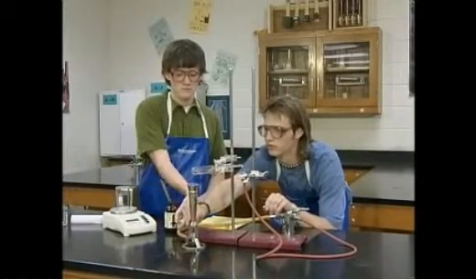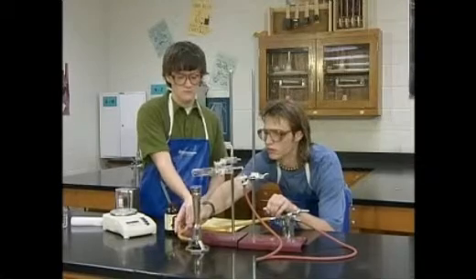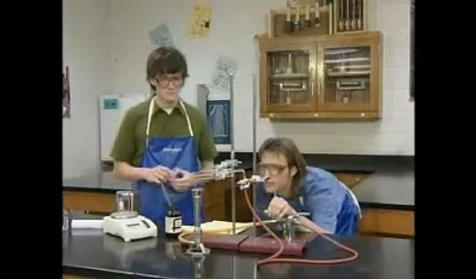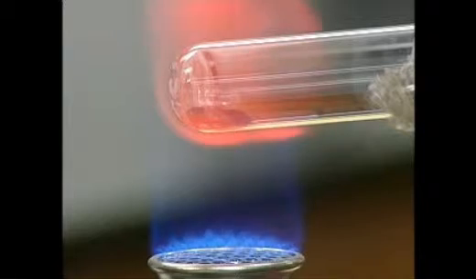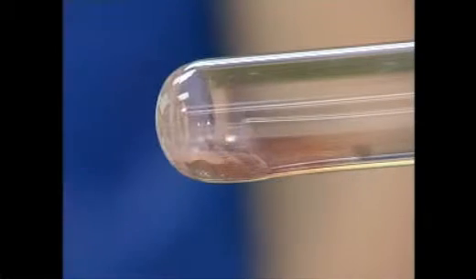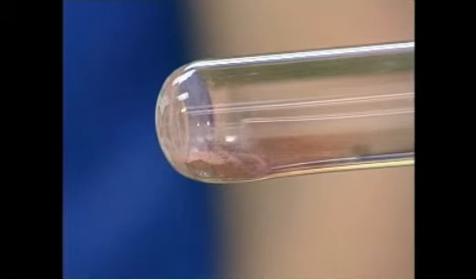The students carefully heat the copper oxide. Methane gas will react with the copper oxide to drive off the oxygen, which reacts with the methane gas to produce carbon dioxide and water. Only copper is left in the test tube.